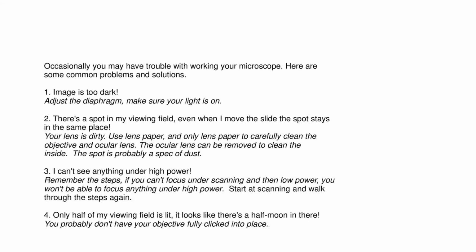I just want to go over some common problems that come up with a lot of students as they're learning to use a microscope. First problem is that the image is too dark. So it's way too dark. For this, you need to check all the ways you can control the light. First thing, check the dimmer. Often the dimmer is turned too low, and so not enough light is going through.